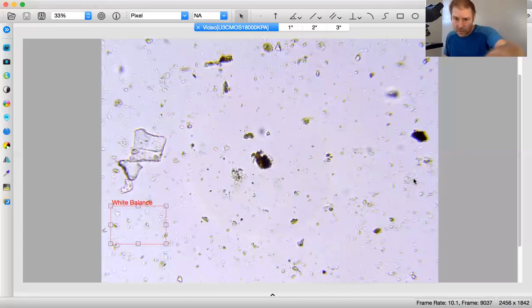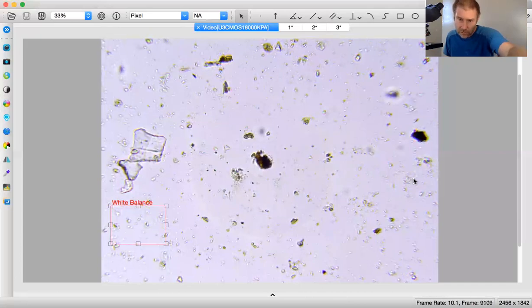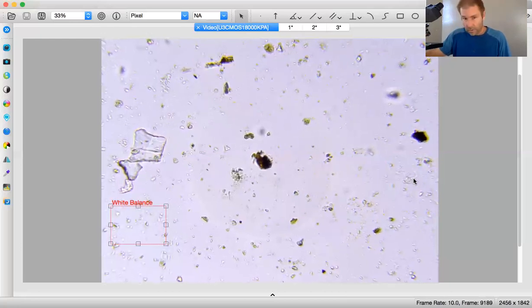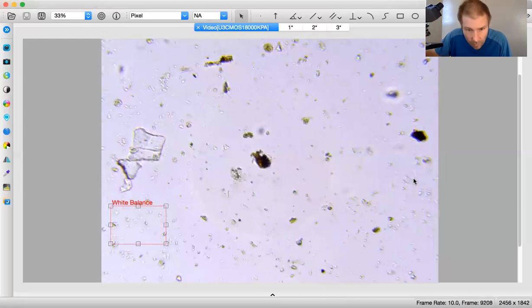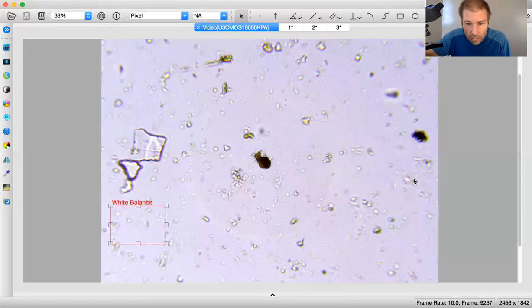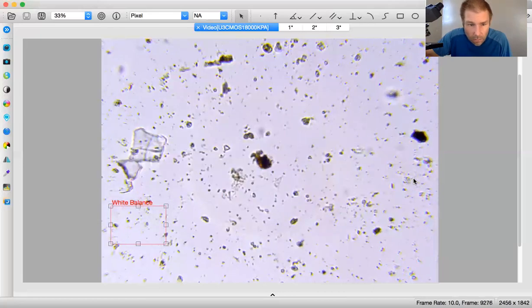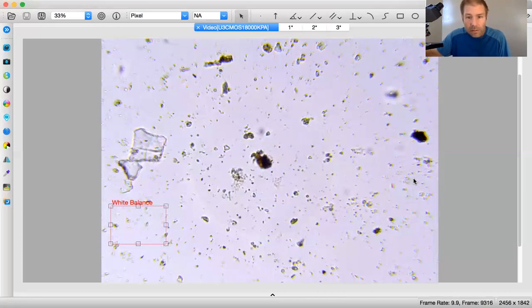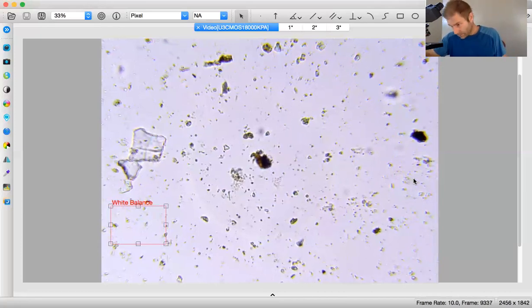Well, I think actually altogether, if I added that up, it would be 1. So I'm going to say 0.1 actino. And this is for reading area 2. 0.1. Just double check here. Nothing else to speak of, so moving forward.